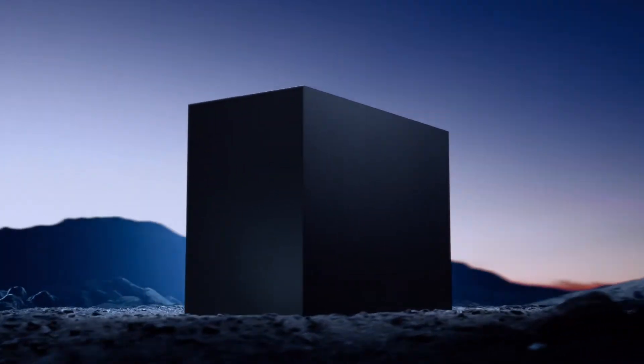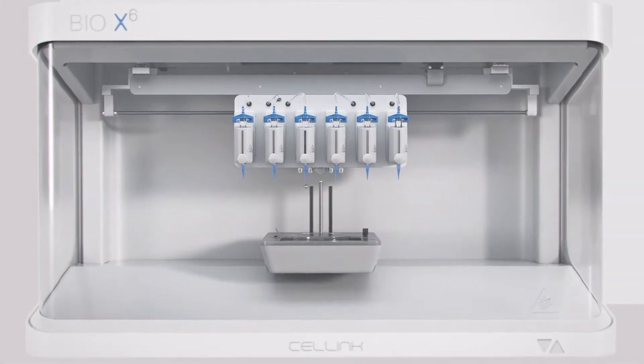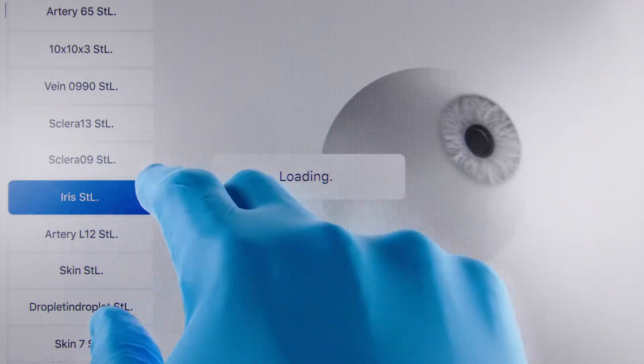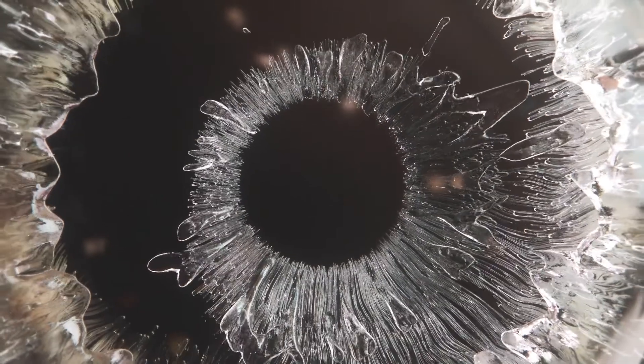The CellLink Bio X6 is an evolution in science and medicine, leading us to incredible medical breakthroughs. It's a 3D bioprinter that prints living structures using cells and other organic materials.